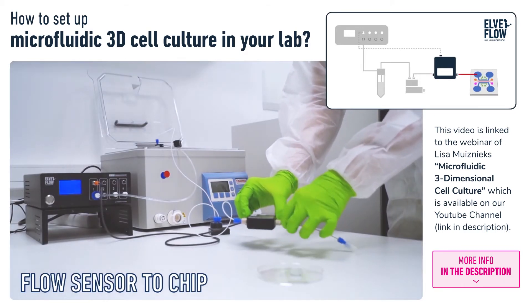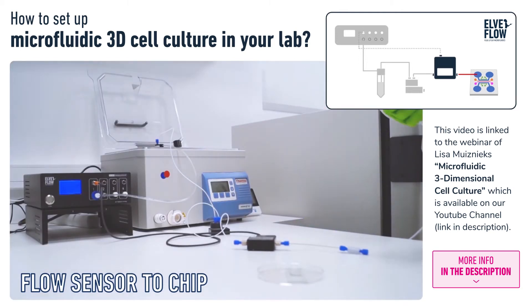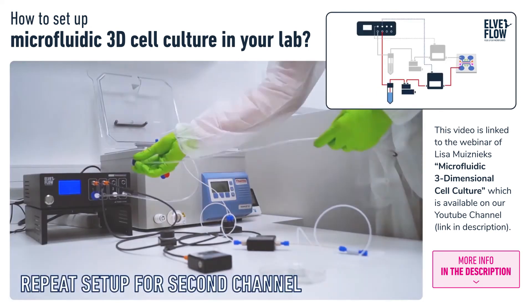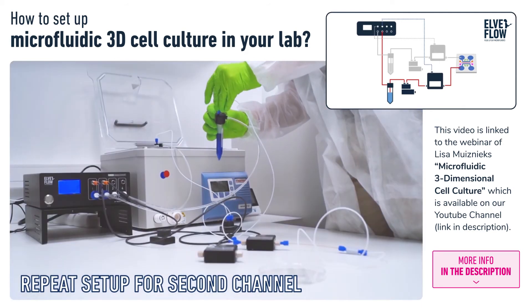Then we connect a piece of resistance tubing, which offers resistance to flow due to its much smaller inner diameter, enabling better control over flow stability. Then we connect to the chip. This liquid will be perfused through one of the side channels of the chip.